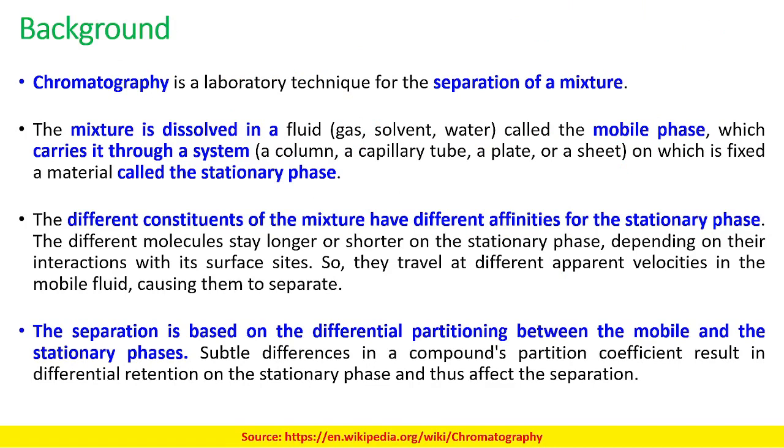So what is chromatography? As I already told you, it is a technique where we are going for the separation of a mixture. Mixture of what? Mixture of analytes. Okay, so the mixture is dissolved in a fluid.